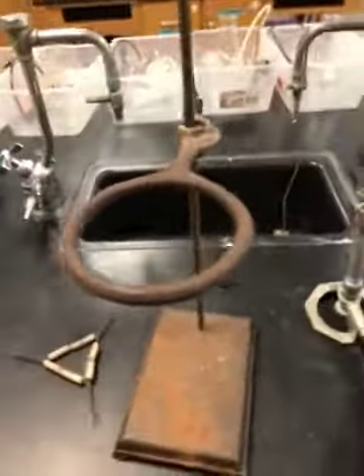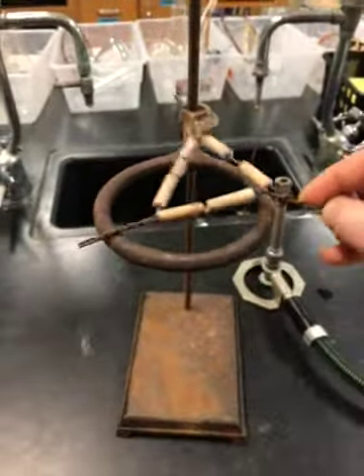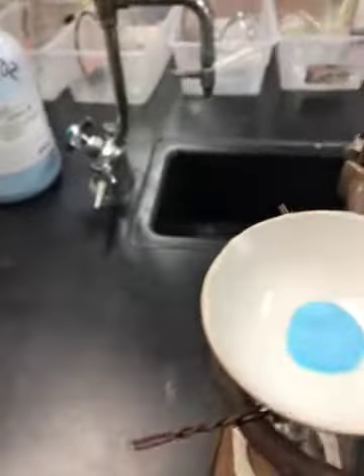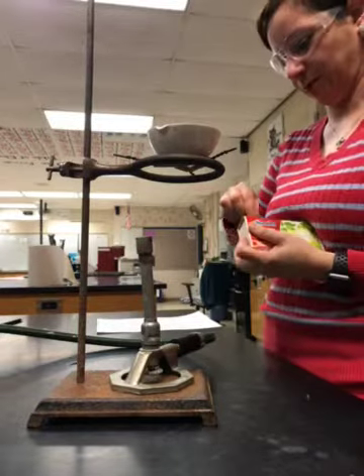And then step 3 says place the evaporating dish over a Bunsen burner, heat the evaporating dish for about 5 minutes. Then we're going to allow it to cool for 5 minutes and mass the evaporating dish with the resulting anhydrous substance. So here I have a ring stand with a ring clamp. On top of that, I'm going to put a clay triangle so that I can put my hydrate in the evaporating dish, and I'm going to heat it up with a Bunsen burner flame. And when we heat it up, we should drive off all the water. So I'm going to go ahead and light my Bunsen burner.